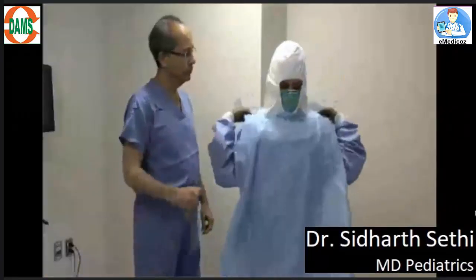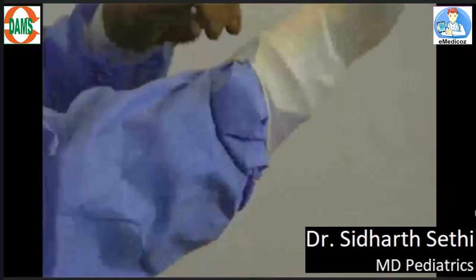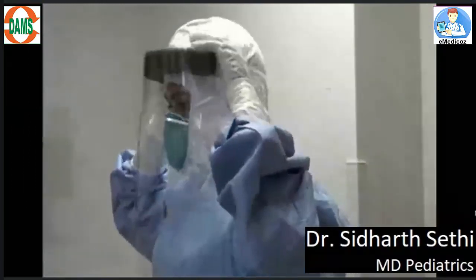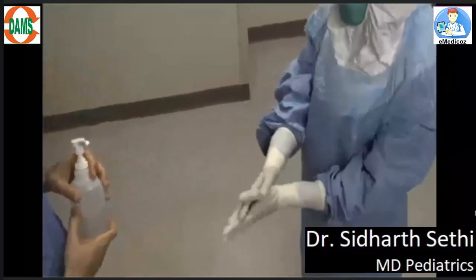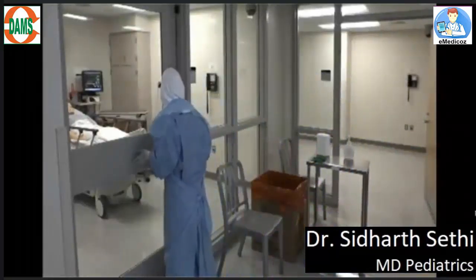Now you need to place the face hood — it should go on till your shoulders. If you have an apron, you can wear the apron at this stage. Now it's time to wear the second pair of gloves, which should go over the sleeve of your gown. Now it's time to wear your face shield — adjust the elastic strap. Turn around and show your observer the integrity of your PPE. Clean your hands again with an alcohol-based handrub. Now you are ready to go inside the patient's room.